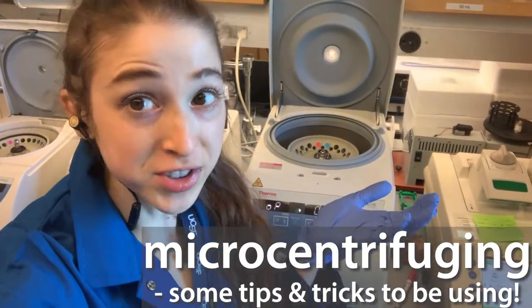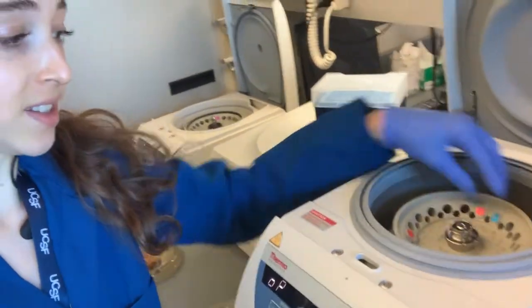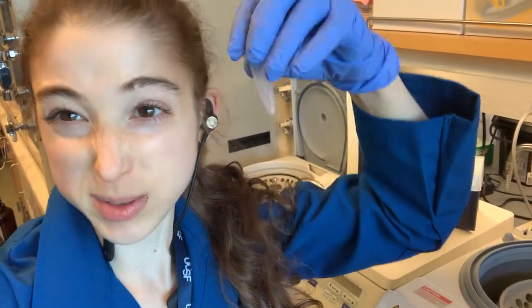A micro post on microcentrifuge tips and tricks. Microcentrifuges are these little things that we can use to spin microcentrifuge tubes — we often call these Eppendorf tubes — really, really fast. Here are some quick tips and tricks for working with them.